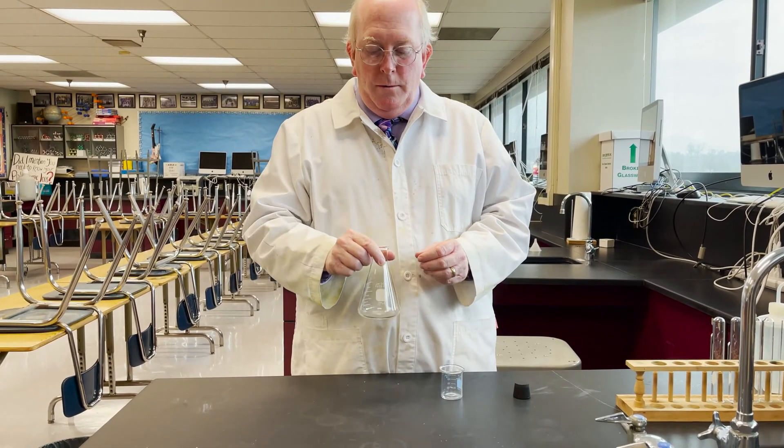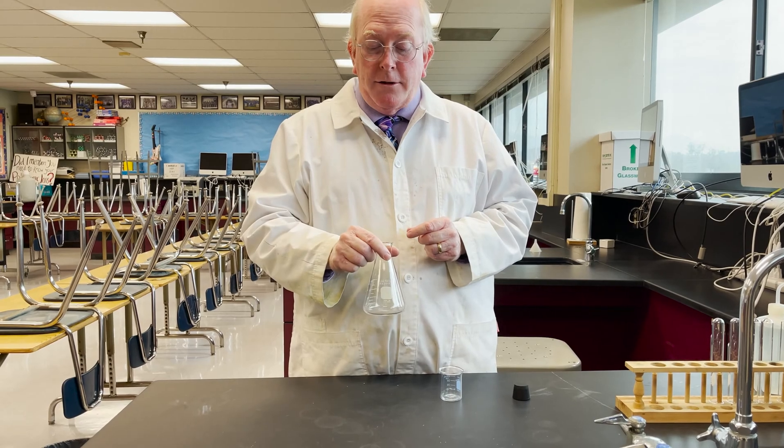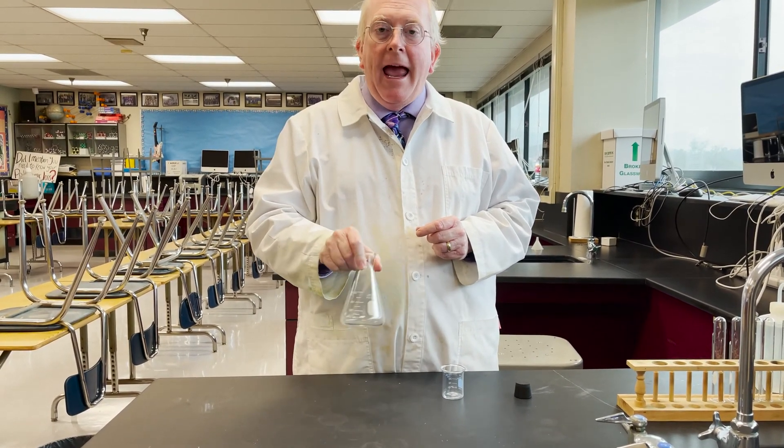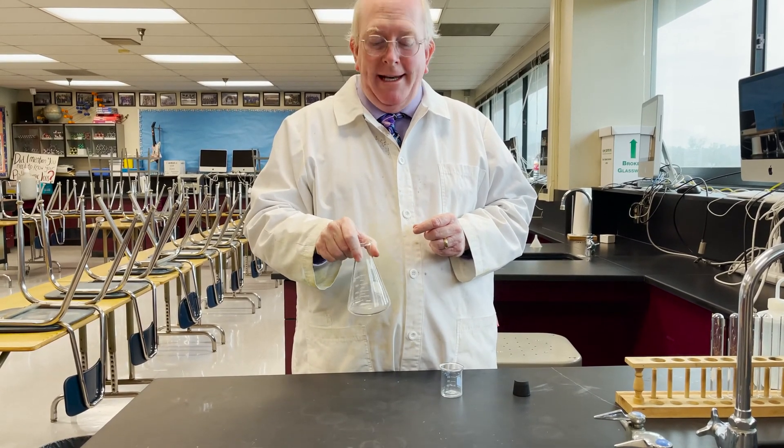Often what we'll do, especially in a technique called titration, is we will swirl the flask as we are adding something. And that's a way of stirring it.